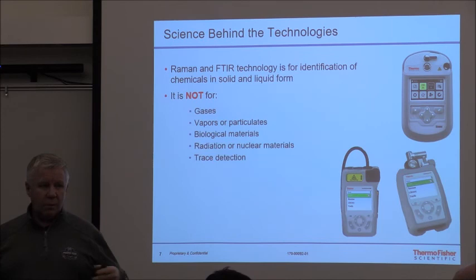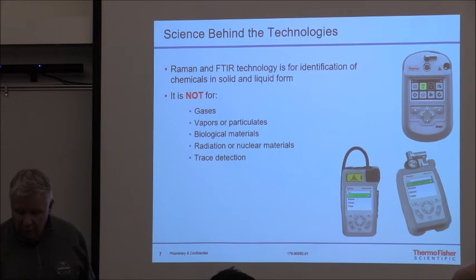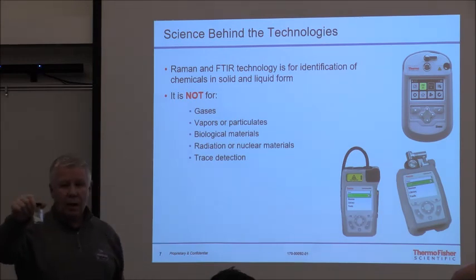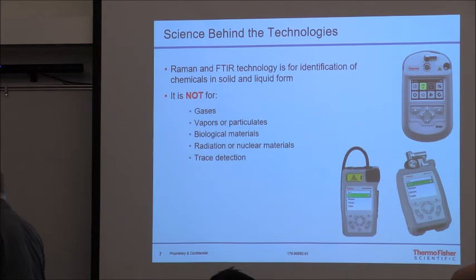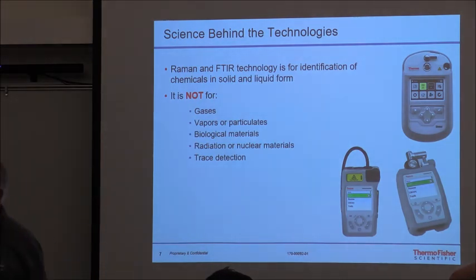It will do mixtures. All devices will do mixtures. The limitation on that is about 4 typically, maybe 5 occasionally. Okay? But from a sampling standpoint, if I ask you, how many chemicals are in here? How many different chemicals do we know? No, not really. Now, if I took another sample, if I took this one, and I pulled that, you can clearly see there's an orange and kind of a white or yellow one. There has to be a minimum of 2, and I know that by visual inspection.